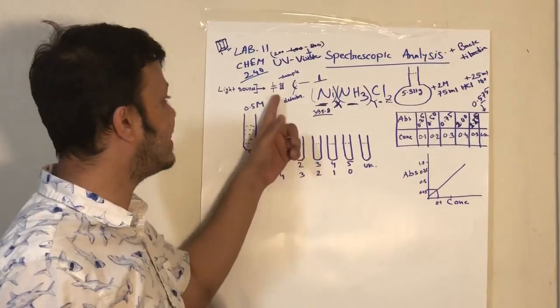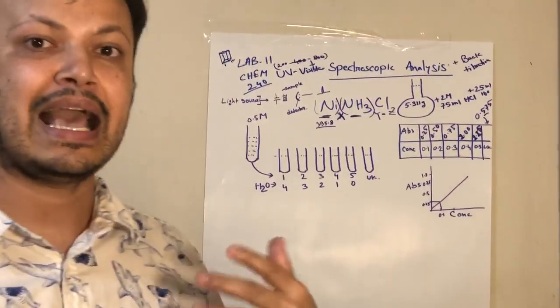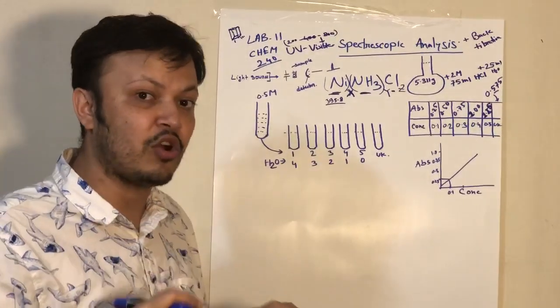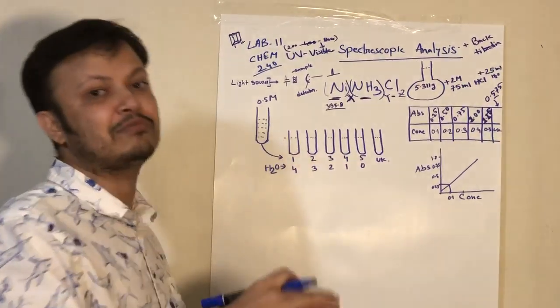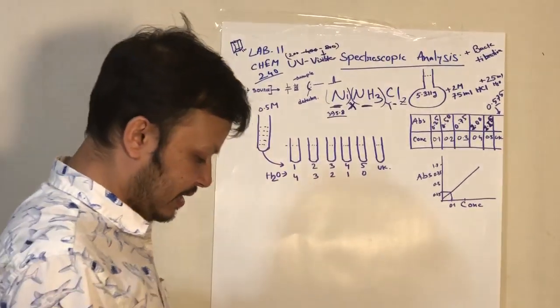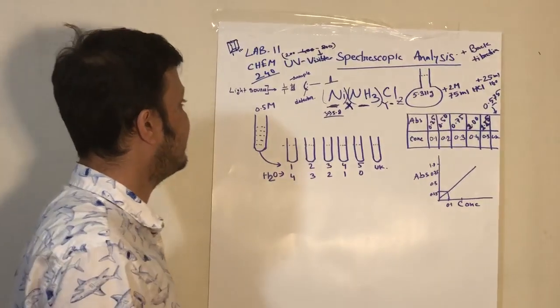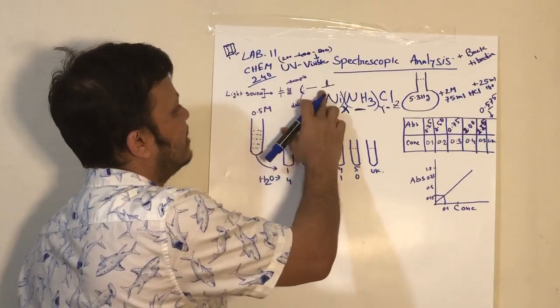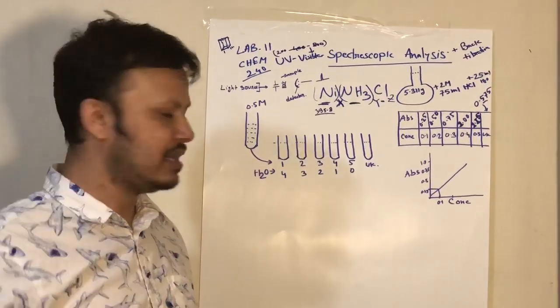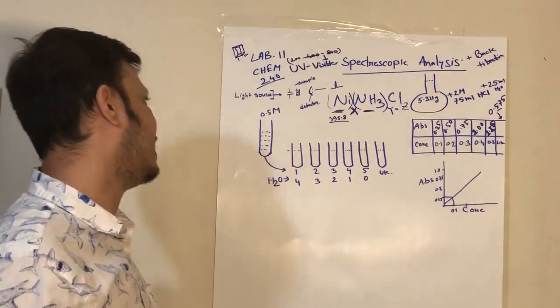With the increasing of the concentration, the absorbance also increases. This is called the Beer-Lambert law. Okay, you will learn it. I think Dr. Zhao already discussed it in your class. Anyway, after transmission, it will be converted into different spectra. From this spectra, we can identify the amount, we can identify the element.